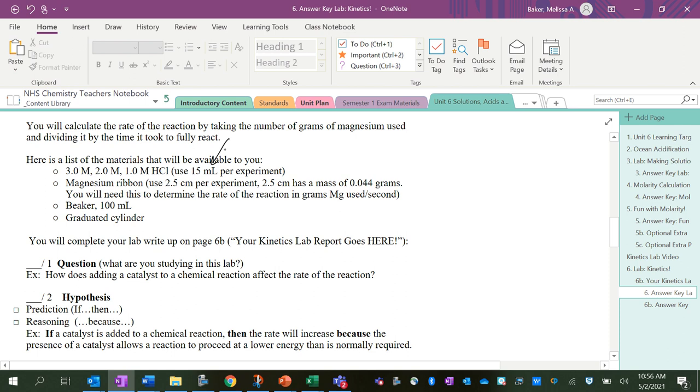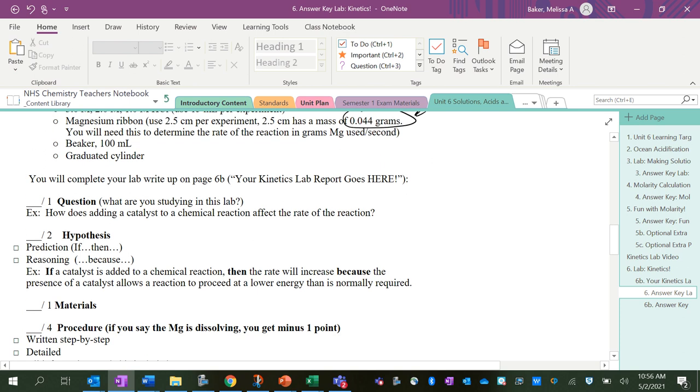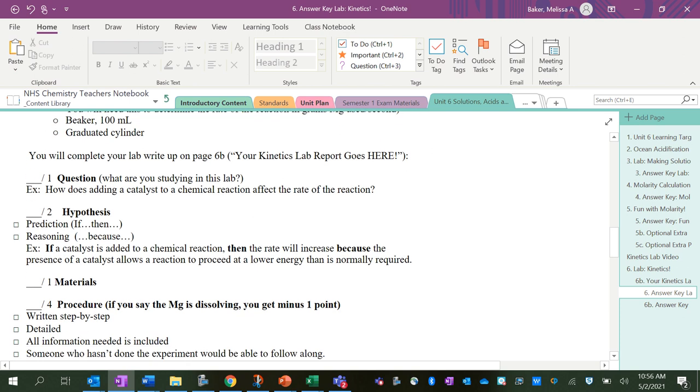The materials are the three different concentrations of hydrochloric acid. We're going to use 15 milliliters per experiment. The magnesium ribbon weighs so little, so we're going to make the assumption that if you have 2.5 centimeters, that it has a mass of 0.044 grams. And that's definitely a source of error, so note that for later. And then we've got a beaker to do the reactions in, as well as a graduated cylinder to measure out our 15 milliliters of acid.